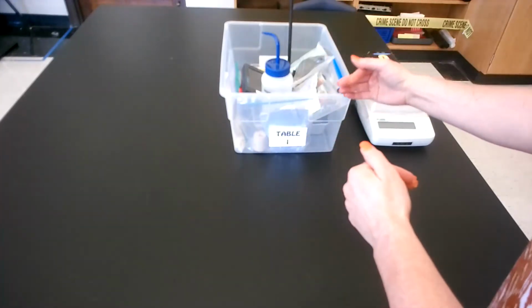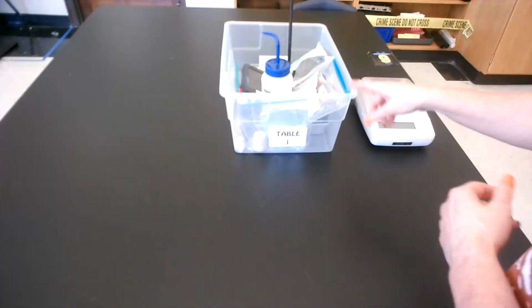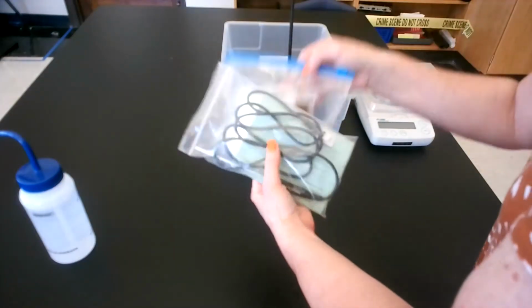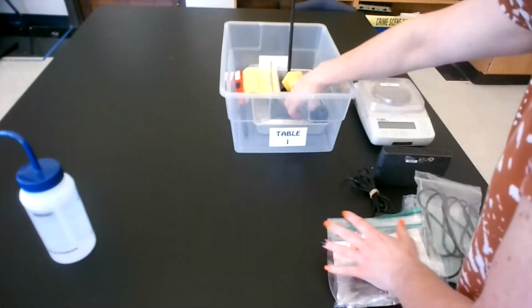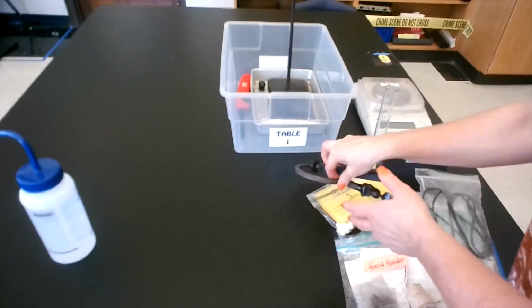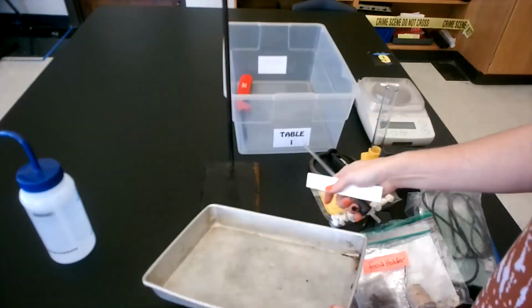So let's go ahead and unload our tub, paying attention to how it comes out. The main thing when you restock your tub at the end is that the tray goes in first, then the ring stand, and then everything else lays in there. So let me take everything out, and then we'll go over each piece as we build our apparatus. So this is our ring stand. Here's our tray.